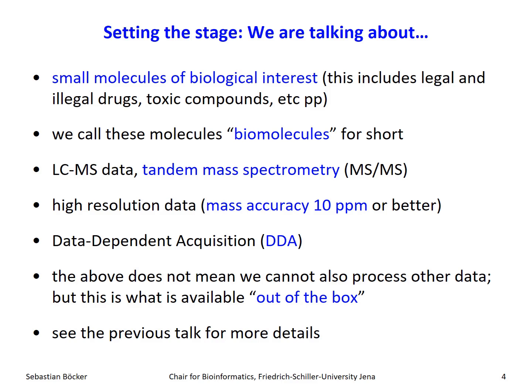We are talking about small molecules. We're talking about small molecules of biological interest. That's metabolites, but it also includes drugs, illegal drugs, toxic compounds, stuff from food, and so on and so on. So everything we might expect to find in our samples.